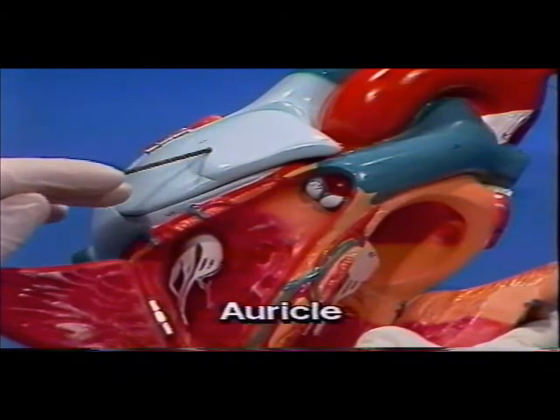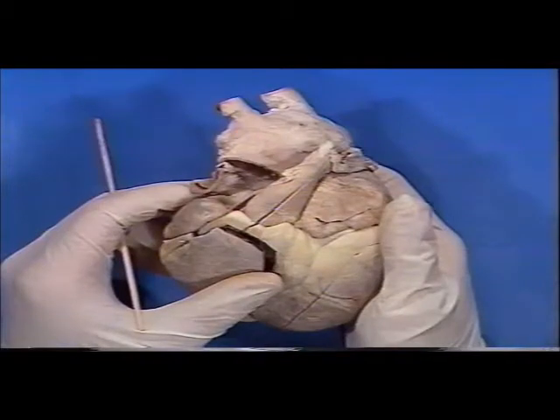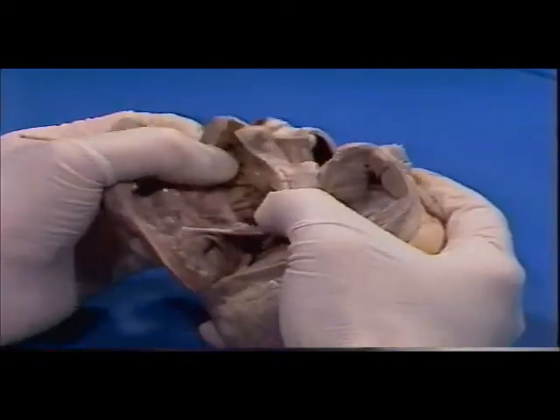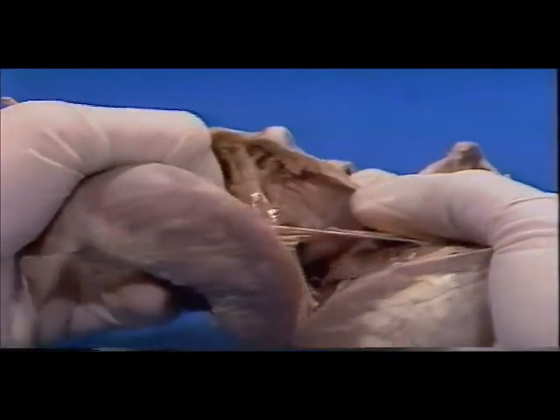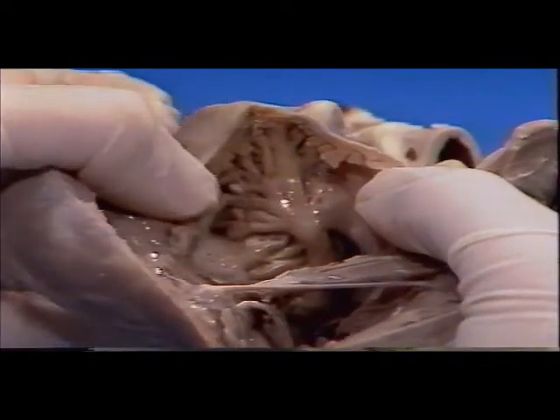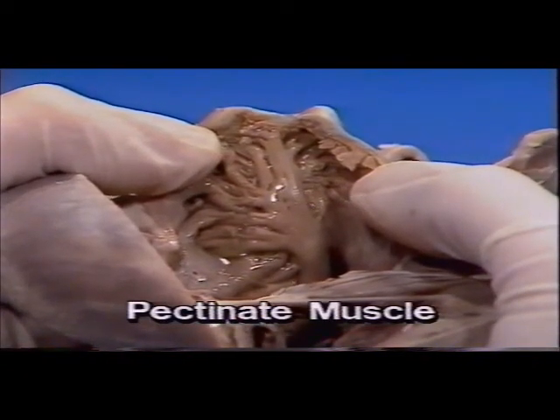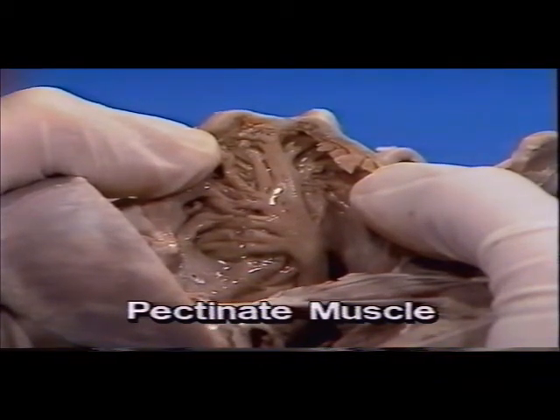We will now examine these chambers in the heart dissection. Divide the upper portion of the heart, as I have done. You can see that the interior of the atrium is quite smooth. The auricles, however, have a texture that is similar to the ventricles. This is caused by the pectinate muscle. This term is applied because of the resemblance of these muscles to a comb, called pecten in Latin.